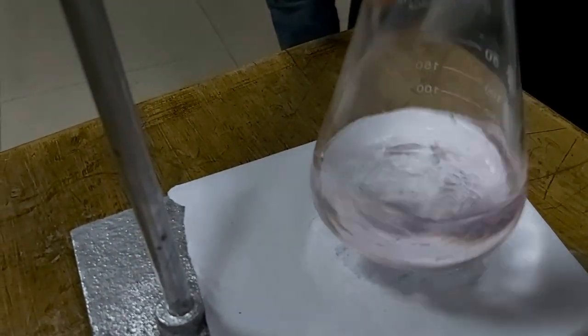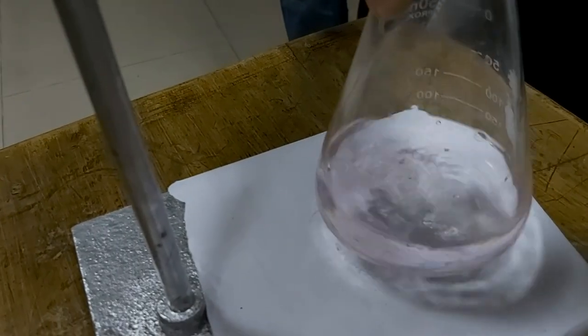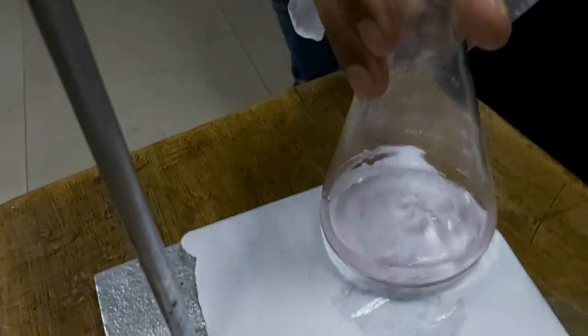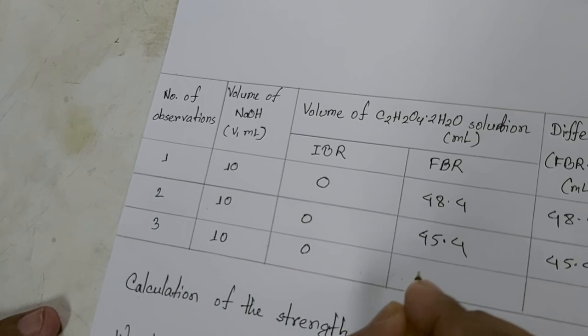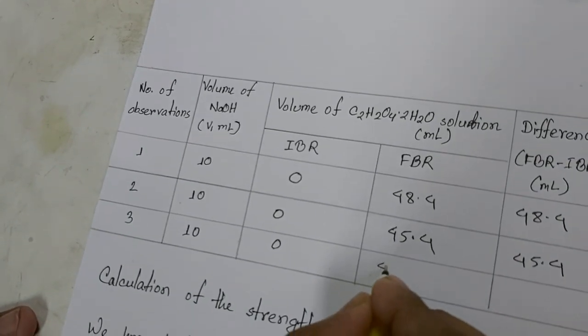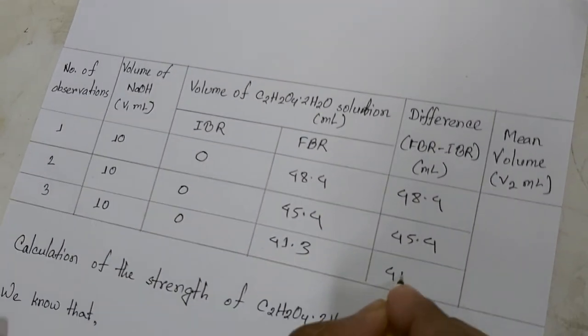We have almost reached the equivalence point. This is the endpoint. The volume is 41.3. The initial volume was zero, so the difference is 41.3.